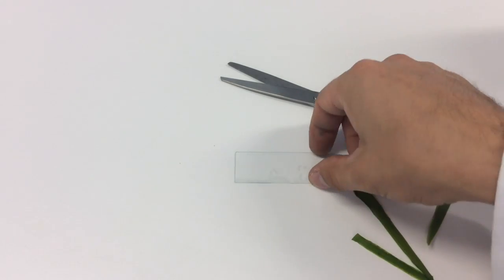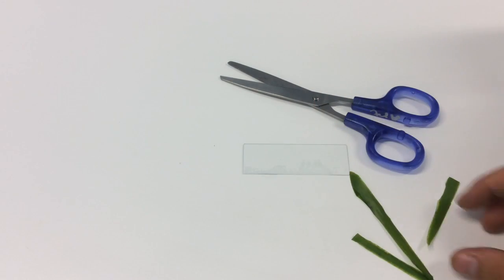Okay, so the materials you need today are a pair of scissors, a slide, and a subject to view. I've chosen a leaf because it is quite easy to get a sample from.